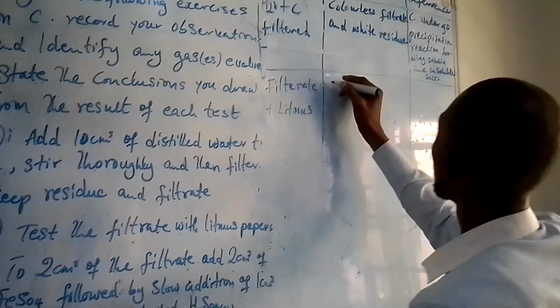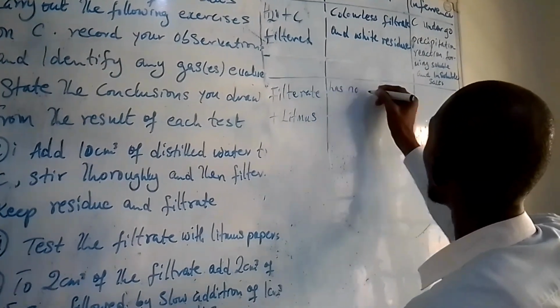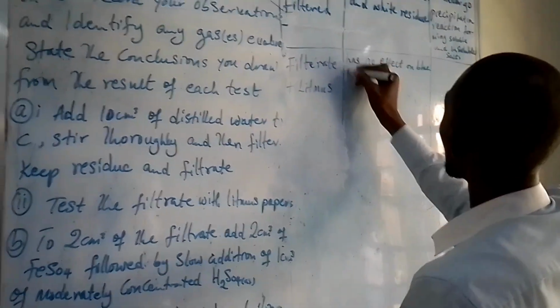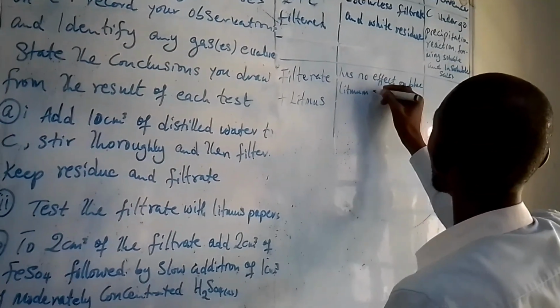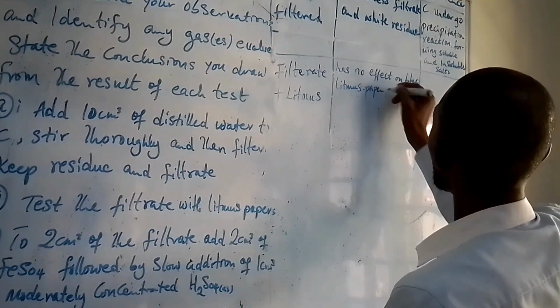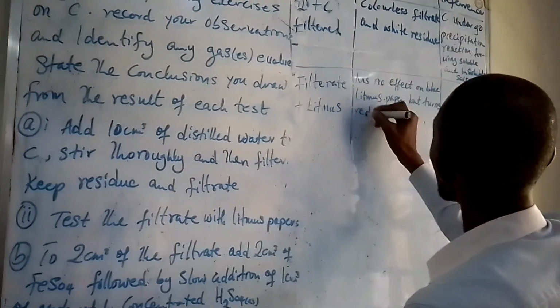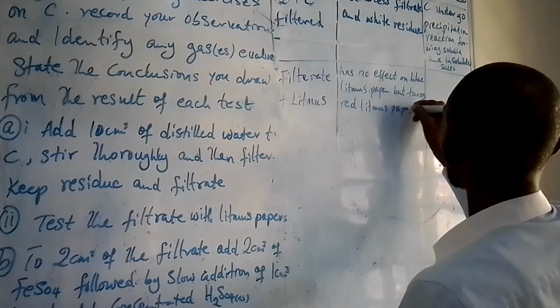Our observation: no effect on blue litmus paper, but turns red litmus paper blue.